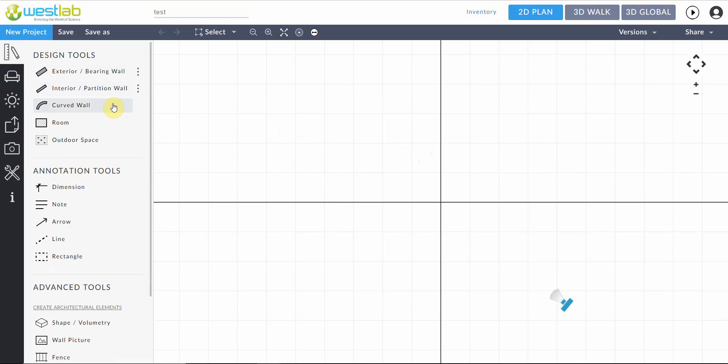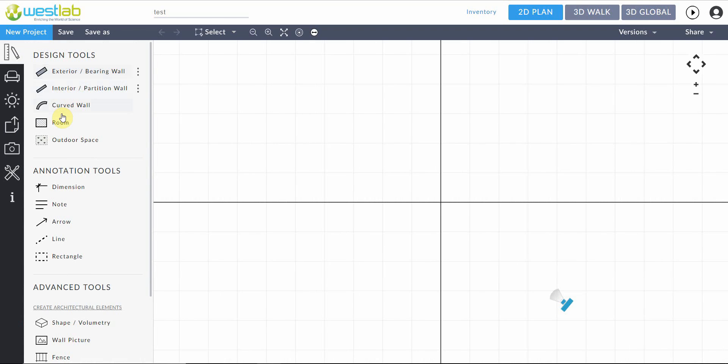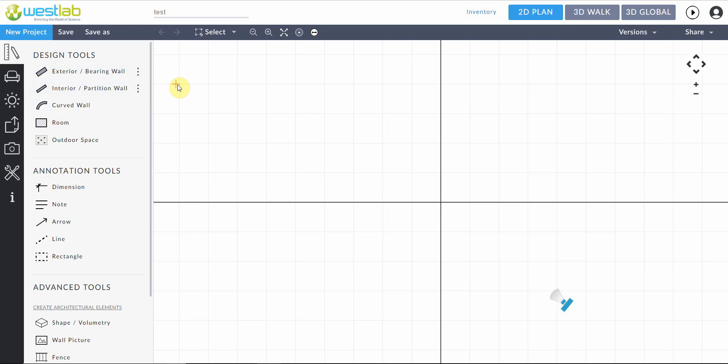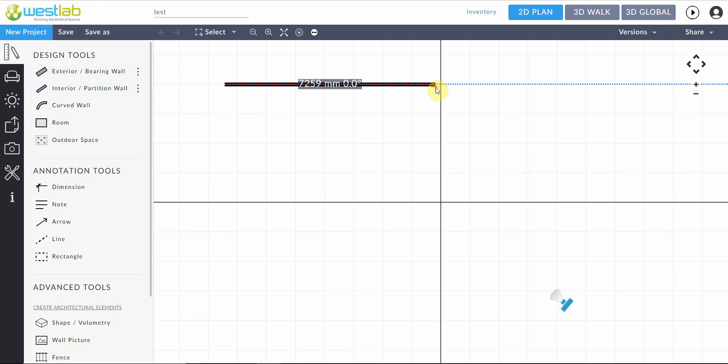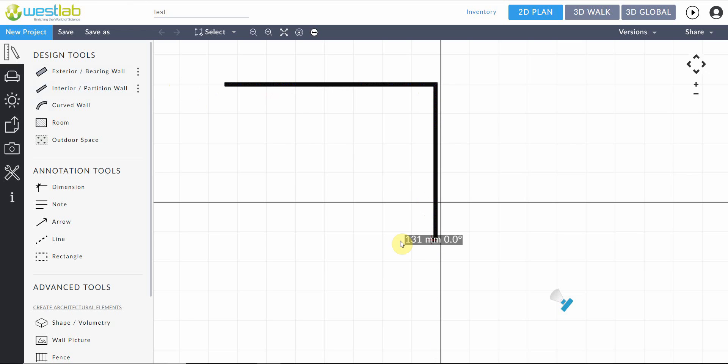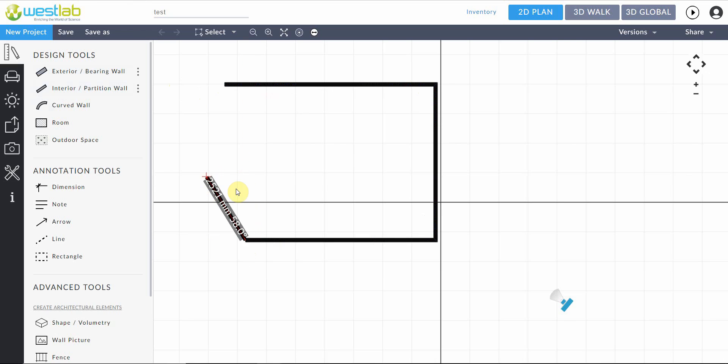To get started on the first tab we see the basic design tools to draw up your laboratory space. First we see three different types of walls. Here I'm just going to select one of them. They basically all have the same functions. So selecting on it brings us to be able to draw the wall like so, dragging across and down to create the space that you require.